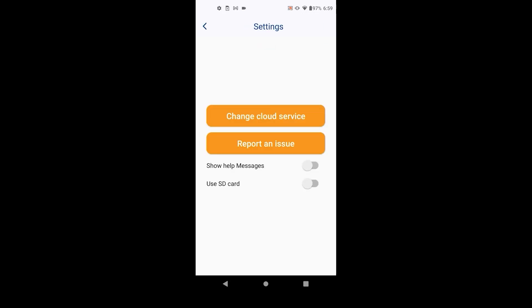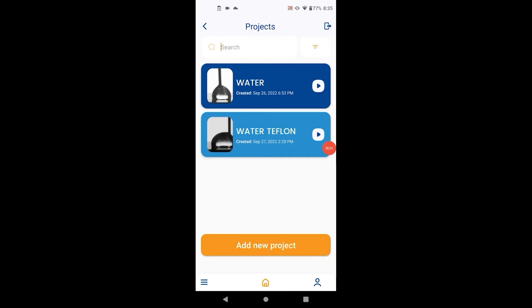In settings, you can choose if you want to store the data on the SD card. You can also choose to save on your preferred cloud service. We currently support Google Drive, Dropbox, Microsoft OneDrive and Box. We also allow you to easily report an issue from within the app via email.